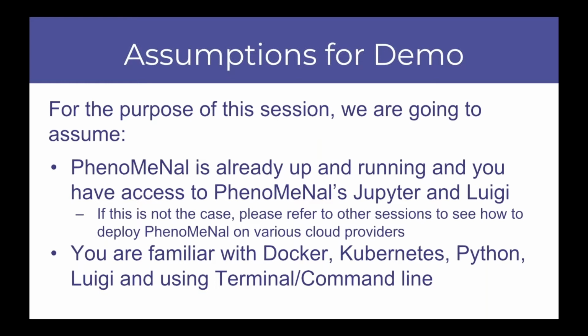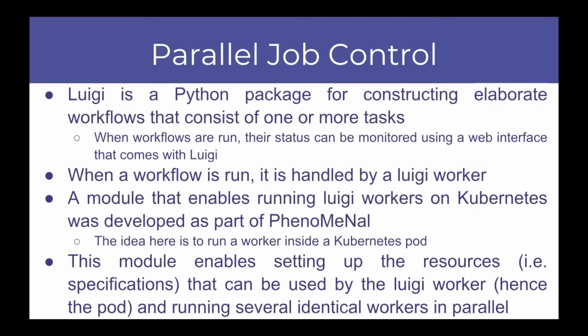And also, I'm going to assume that you have some familiarity. You don't have to be an expert, but at least you have some knowledge of Docker, Kubernetes, Python, and Luigi. And also, you're comfortable with using a terminal or the command line. Okay, so you don't have to be an expert, but at least you have some knowledge of that. Now, we mentioned that Phenomenal.